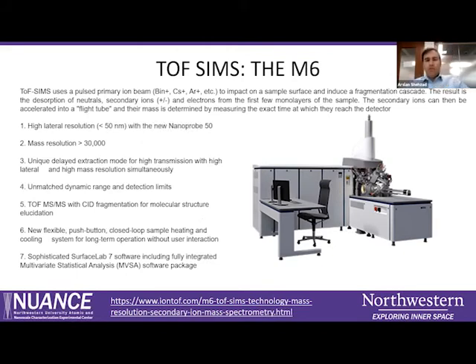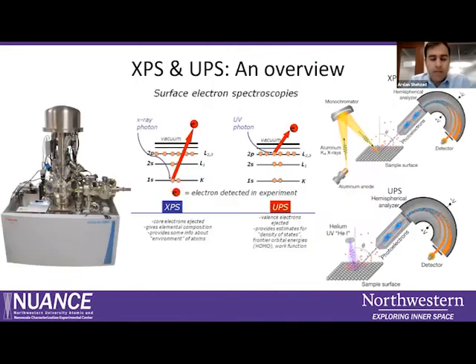With that, I'm going to jump into the second part where I'll be discussing a little bit about UPS and XPS. Just an overview of XPS, how does it work? I hope most of the people know, but usually you use XPS because of the higher energy of the X-rays. You can look at the binding energy of the crystals by looking into the core electrons coming from a K-shell.